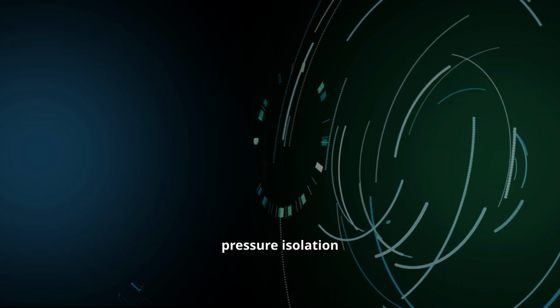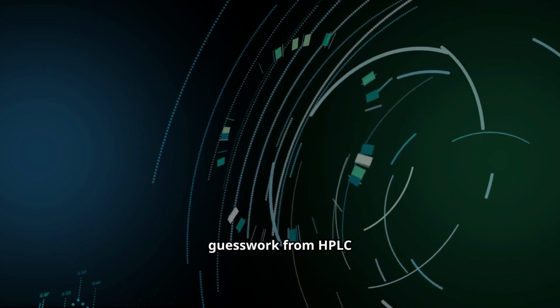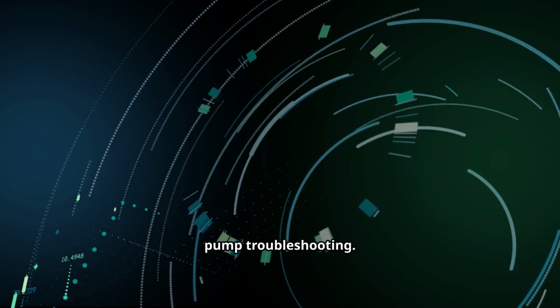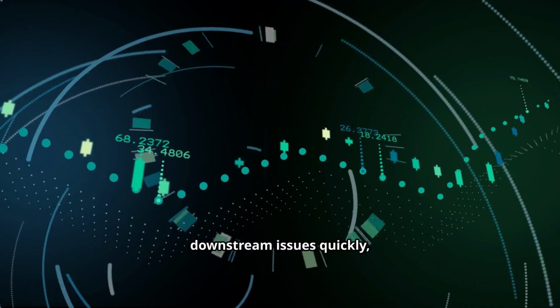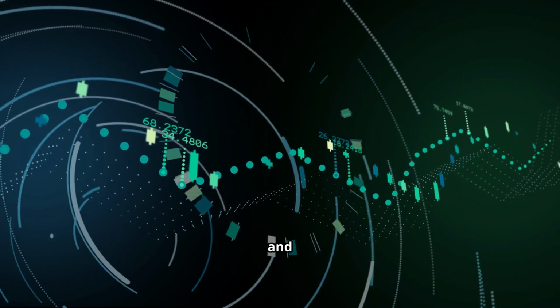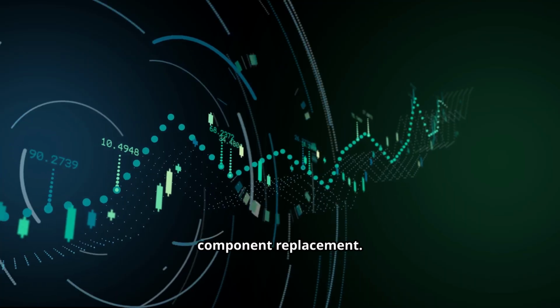In summary, pressure isolation is a physics-based, systematic method that removes guesswork from HPLC pump troubleshooting. It allows analysts to distinguish pump failures from downstream issues quickly, objectively, and reproducibly, saving time, solvents, and unnecessary component replacement.